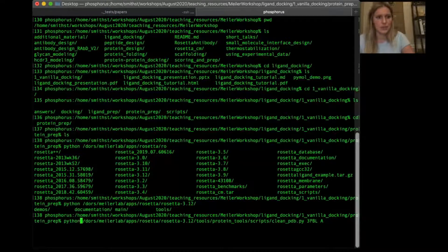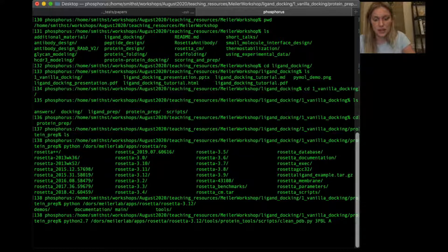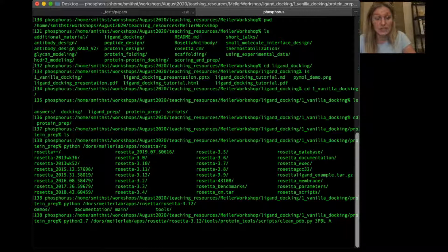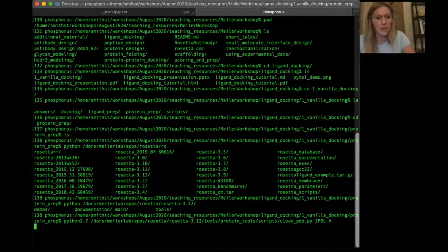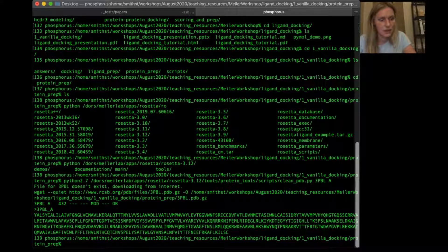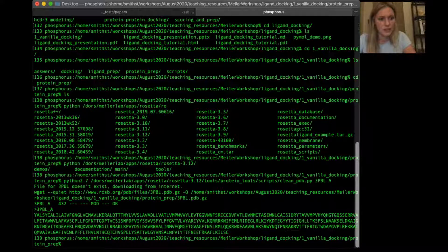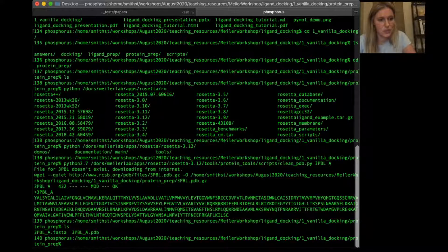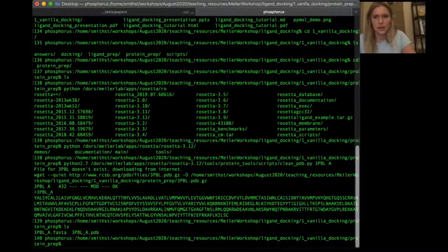I need to designate Python 2.7 here. What this is saying is: I want PDB ID 3PBL and I want chain A. What this script actually does is — if it doesn't already exist as 3PBL.pdb in your current directory — it will go and grab that from the PDB. It went to rcsb.org and picked up the PDB file. This output is the FASTA file output. Now if we ls, we have 3PBL_A.pdb and its corresponding FASTA file.